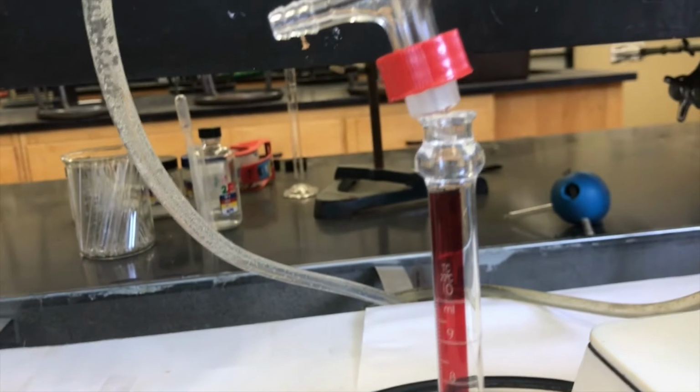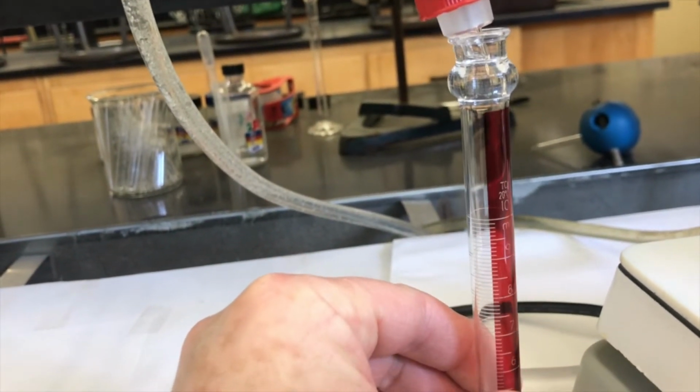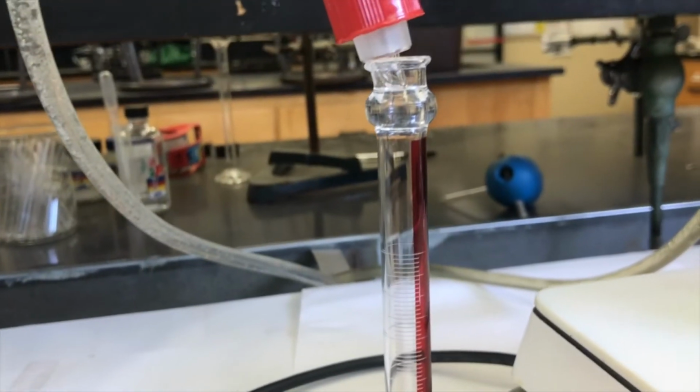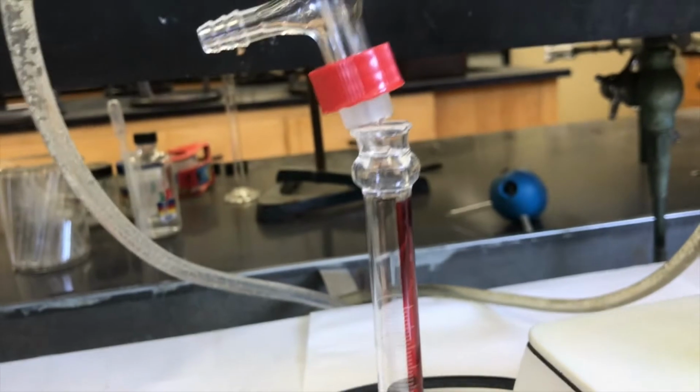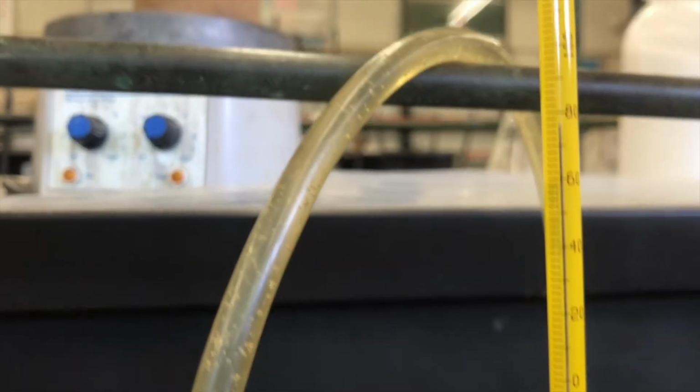I guess I don't need to wrap it. It's pretty warm in lab today. So I think I'm beginning to see my first volume of solvent. Boom, boom, there's some drips, yep. When it gets to about 0.5 milliliter, I'll read the temperature. I'm going to say it's 76. So half a milliliter, 76.